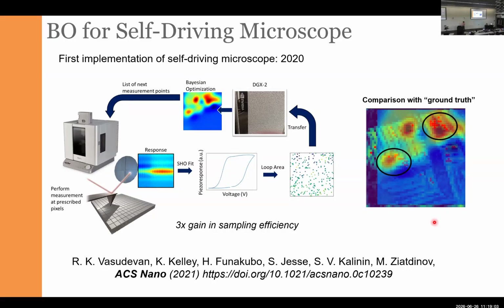And by that time, we developed the workflows for running the GPBO for the exploration of the image places. So the process itself was kind of difficult, because the first time you do something like this, the difficult part is building the connection from the instrument and the control computer. But at that time at Oak Ridge, we had a way to do that.